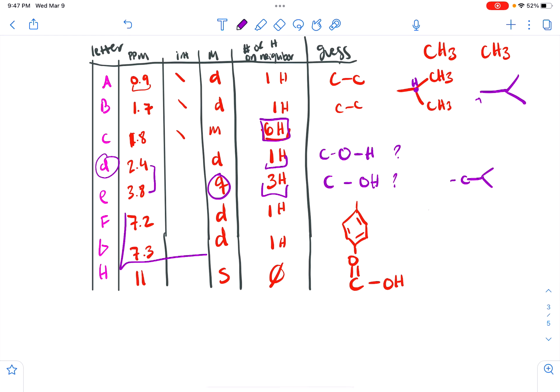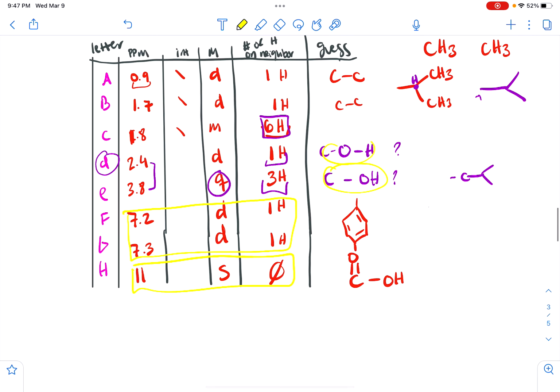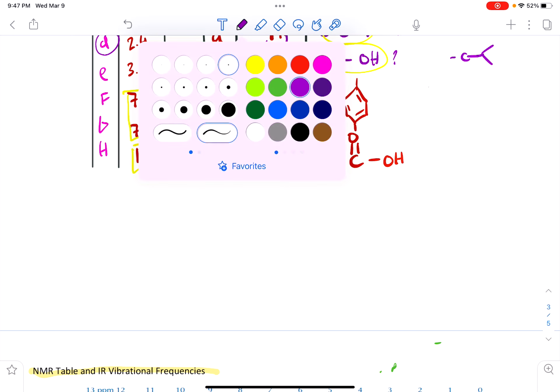And then obviously, I'm going to make that a different color, obviously we have our parabenzene group we already identified, as well as our carboxylic acid group that we already identified down here. So these are our puzzle pieces right now, and we're just still thinking about our alcohols, forming our puzzle pieces, but we're going to try and make this structure. So I'm going to make my final structure in purple down here.